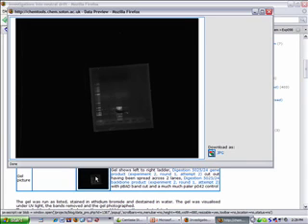And to be fair, that's for what she's done here. That's actually for this type of low melting gel purification. They don't actually get a lot better than that, to be fair. Okay, that's actually not terrible. So actually, the light's not terribly good either, is it? Yeah, it's better now. You can see it better now.